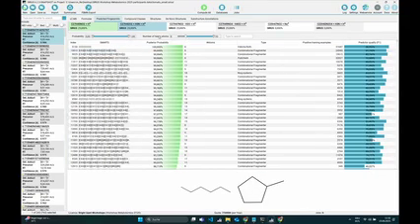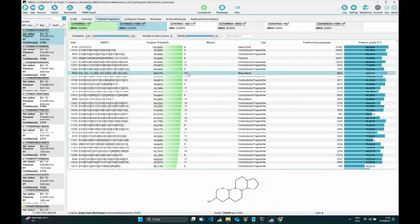Let's just increase the number of heavy atoms. And I can see this example I wanted to show. So if we click on this, we can see, okay, we expect our compound, whatever it is. So we haven't done any database search yet. We expect our compound to have this kind of ring system included. And what you can see here is if we have this row, we have the posterior probability, which is how likely is this particular property contained in our structure, and you also have the predictor quality, but I will show this a little bit in the next view.